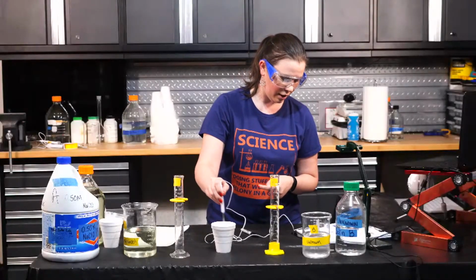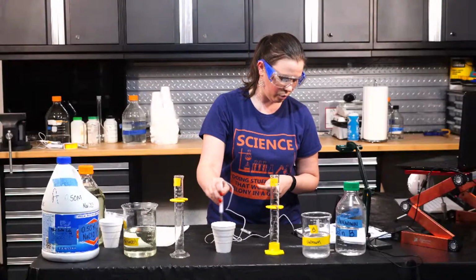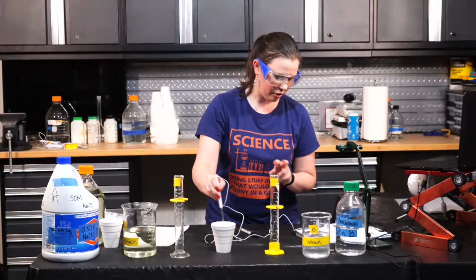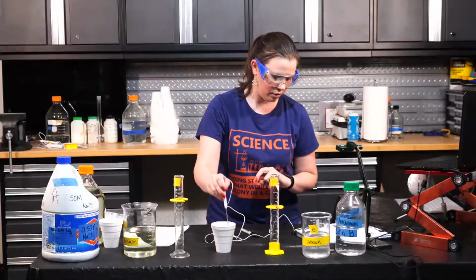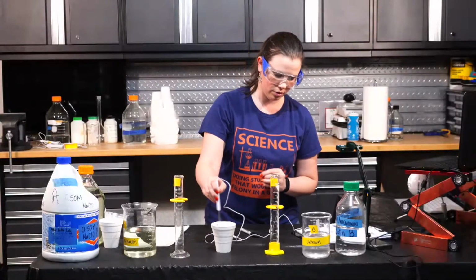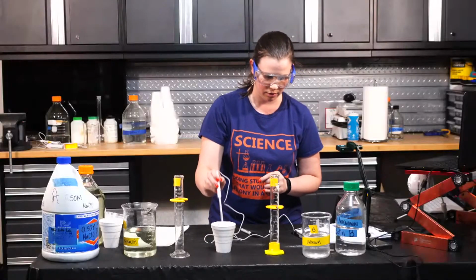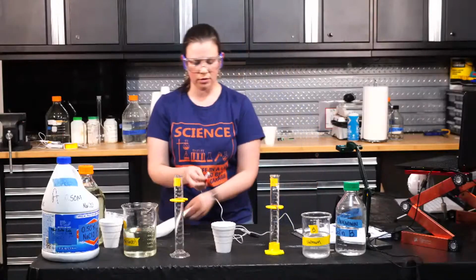Oh, wait, I lied. It went up a degree. 30.1. Now it's kind of flickering between 30.0 and 30.1, but our maximum temperature is 30.1 degrees Celsius. I'm going to go ahead and move on to level 4.